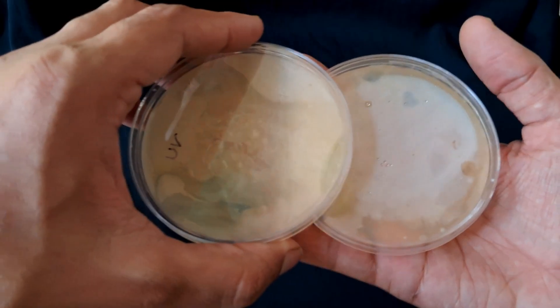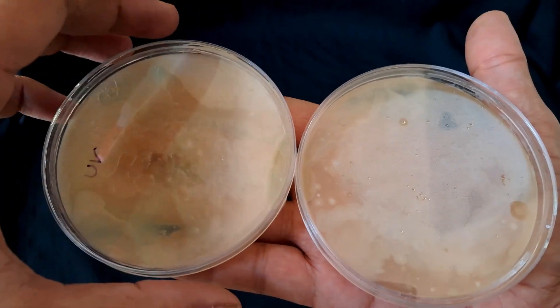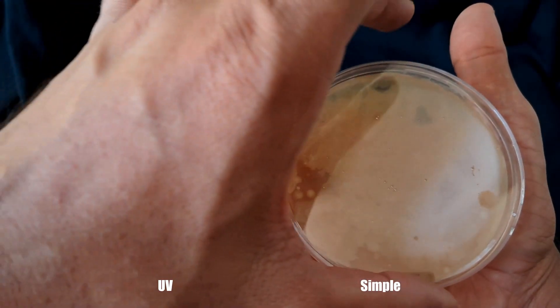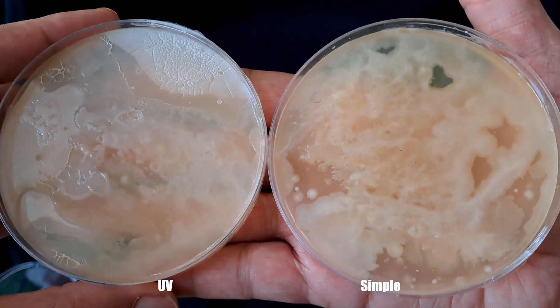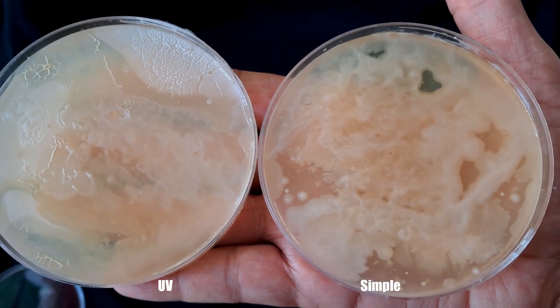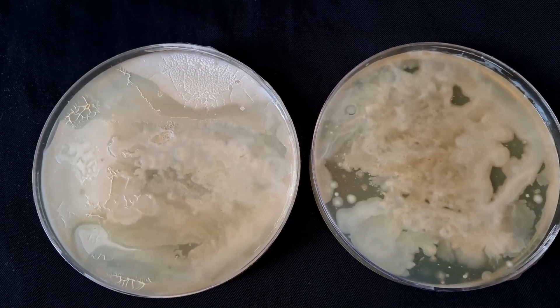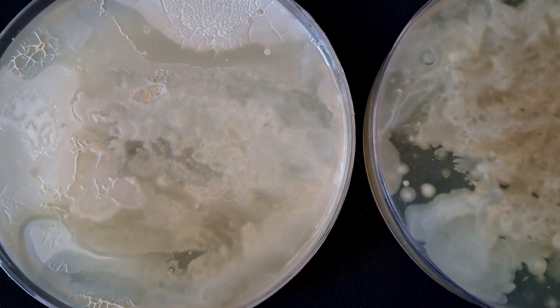After 7 days I removed the bag and saw some changes. The dish without UV sterilization has more bacterial growth. No matter how hard we try, we still get some bacterial and fungal contamination during the process — so mostly we work under flames to avoid contamination.